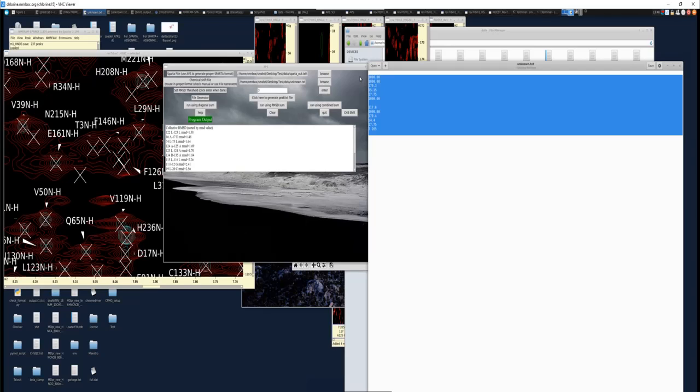The Sparta Plus will always be the better approach because some amino acids that might be outliers, that might have unique chemical shifts because of the structure, will show up very nicely in Sparta Plus, whereas in BMRB, they would actually have a higher RMSD and be difficult to assign because they are outside of the average normal ranges that you would get for those amino acids.